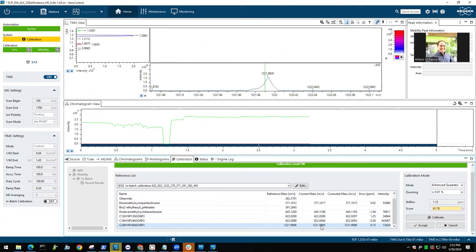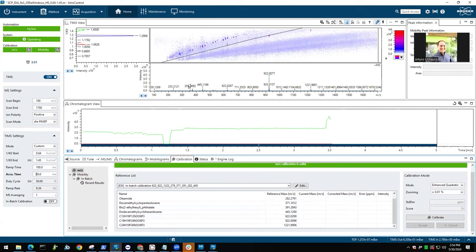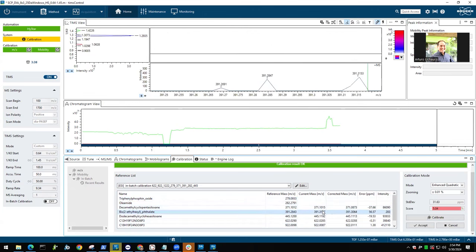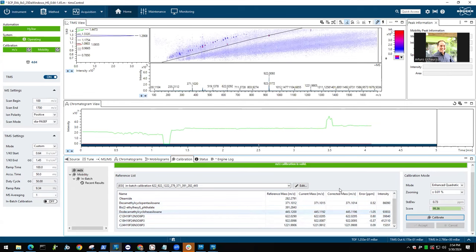Now we should actually see some masses here, but I think we had this earlier today as well. I think the intensity might be a bit too high. So I want to achieve a good score, right? You have your signal here, it's being selected, there's nothing else around. And you see this value here and the ion mobility value, it's really present. That one looks good, it's selecting the right one. The score is good. So if we click accept, the instrument is now calibrated.